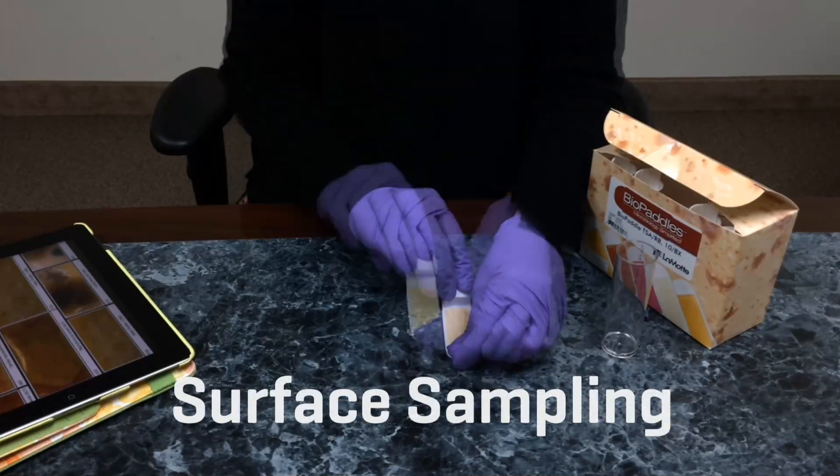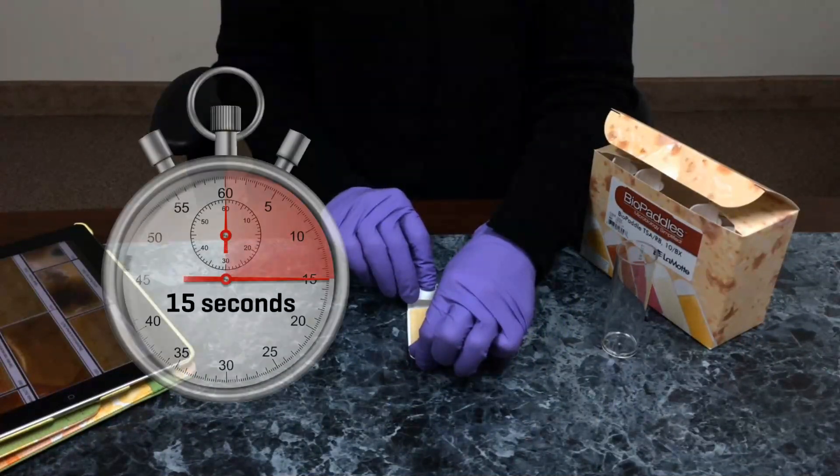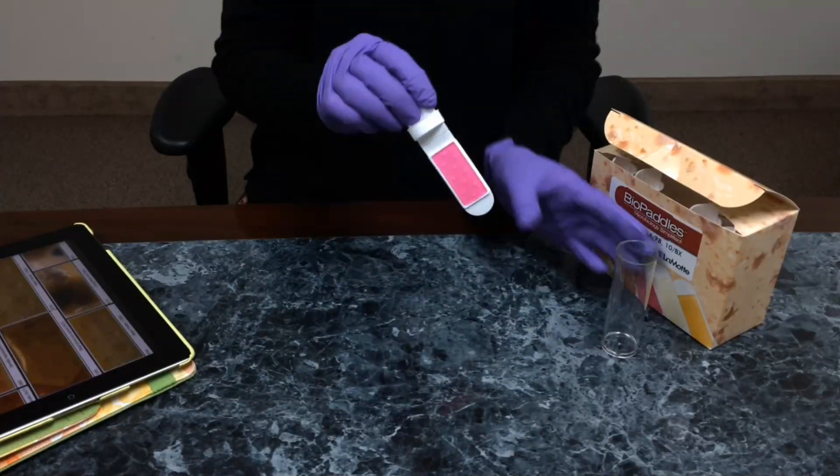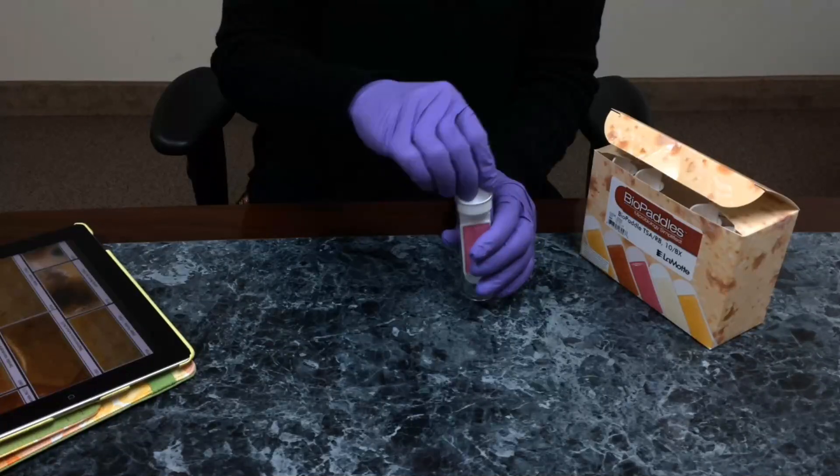For surface sampling, touch the paddle twice to the sample surface, allowing a contact time of 15 seconds. Replace the paddle in the vial. Incubate following directions.